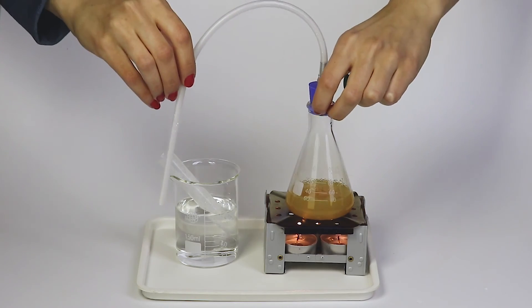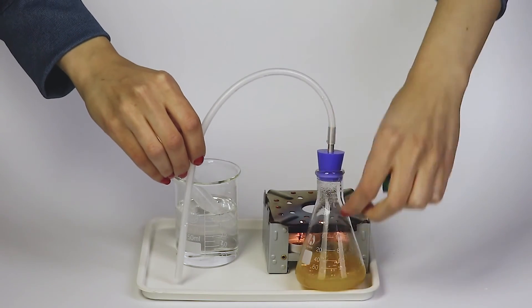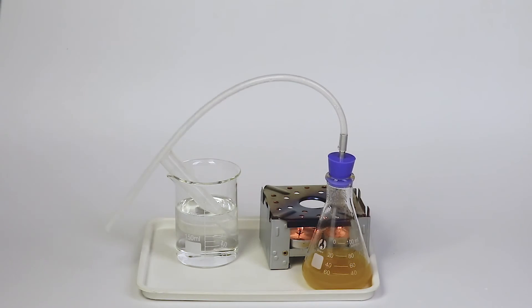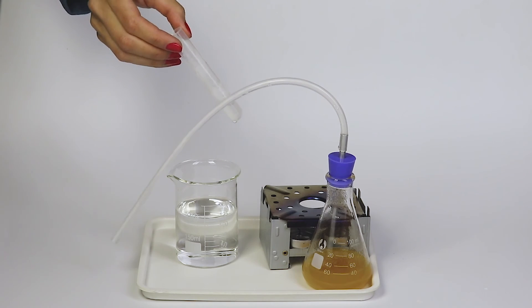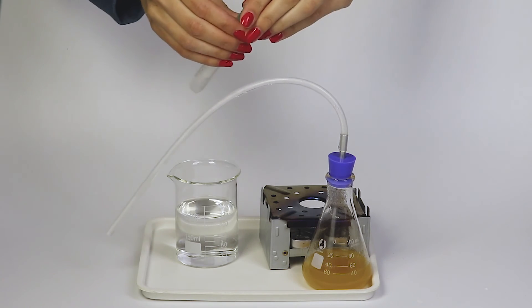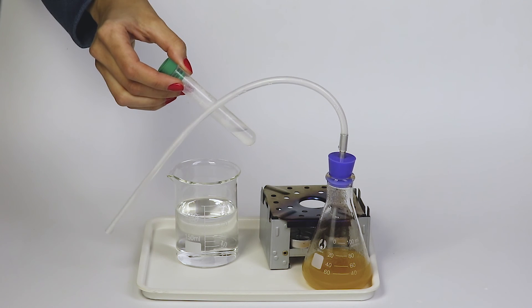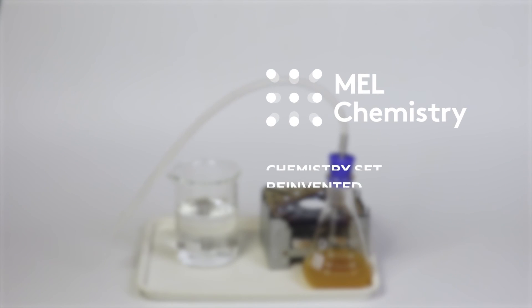Wait until a little essence has collected at the bottom of the test tube. Despite being totally transparent, this liquid will have a strong fruit smell. You can preserve the essence by sealing the test tube with a stopper. Learn more about this experiment on our MEL Science website.